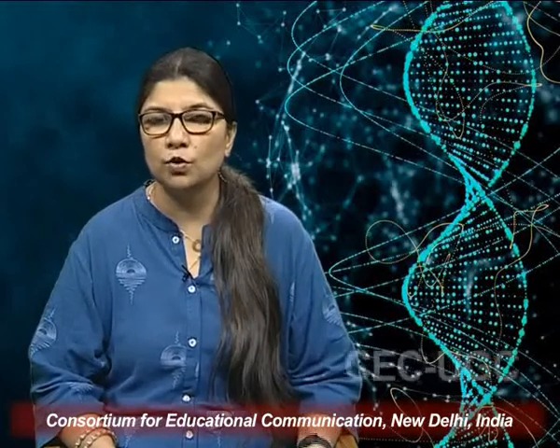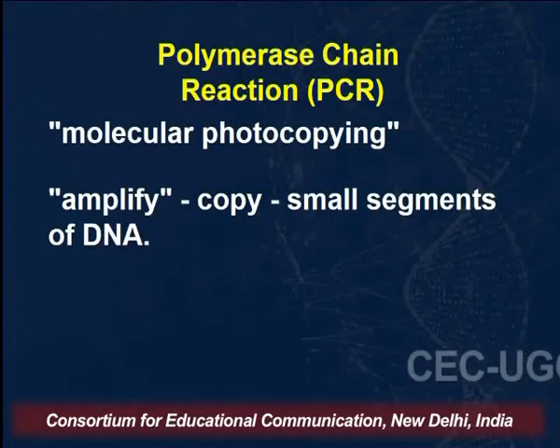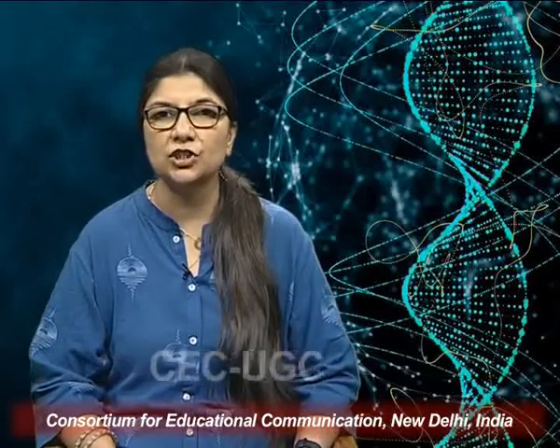Because we are using molecules such as the polymerase and DNA and template, it is termed molecular photocopying. So we amplify small segments of DNA and therefore it is called PCR amplification. It can be called gene amplification, or simply that we amplify small segments of DNA.